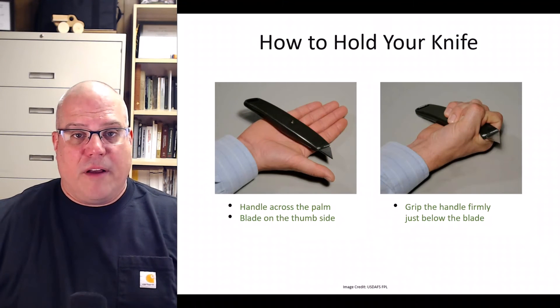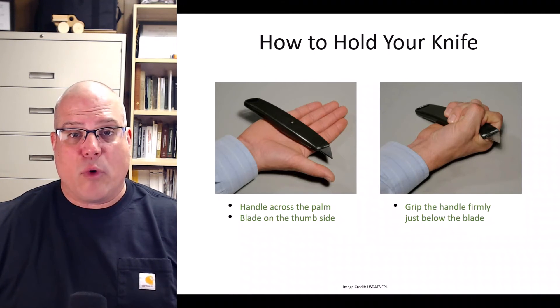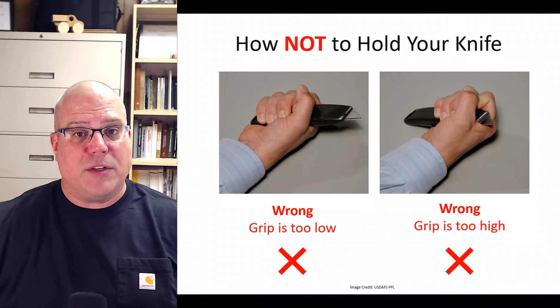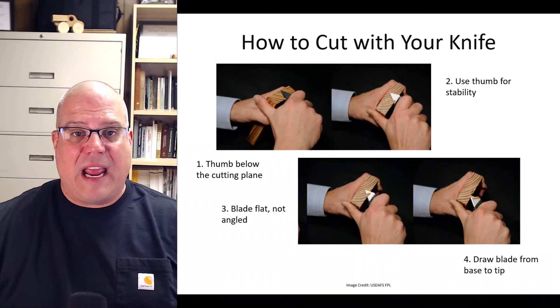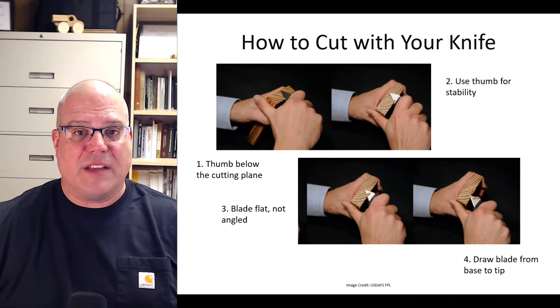Now let's learn how to hold the knife. Hold out your right hand palm up. Place the handle of the knife in the palm as shown in the image, making sure the blade is pointed in the same direction as your thumb and the cutting edge is facing you. Then grasp the handle firmly. You do not want to grip the handle too far down as it is harder to control, and you don't want to grasp it too high as your skin could come in contact with the blade. Make sure no portion of your thumb is above the cutting plane — even if the blade slips, you shouldn't cut yourself.